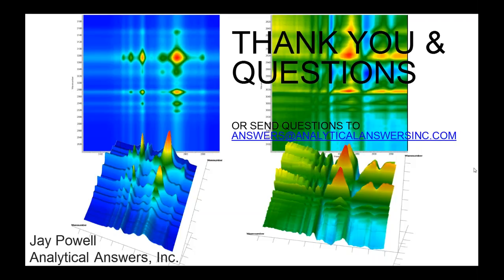Okay, Simon, that's actually a good question. Quite often here at Analytical Answers, you ask a question and we will ask a couple of questions back, depending upon the adhesive coating and what it is you're looking for, how thin or how thick the coating is, and the substrate. There's a variety of techniques we could do. For example, if we were looking at a migration of a low molecular weight solvent through the adhesive, with ATR, we could place the adhesive against an ATR crystal and then monitor over time the migration of that particular component as it comes up towards the interface of the adhesive with the ATR crystal. We can monitor that as a function of time.